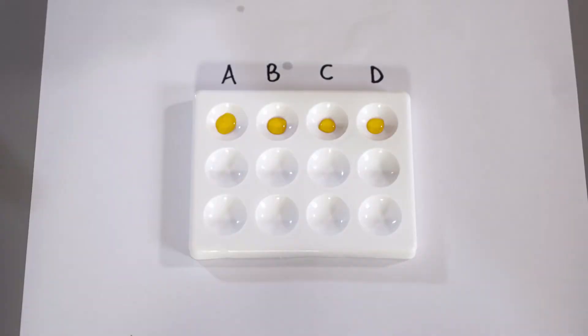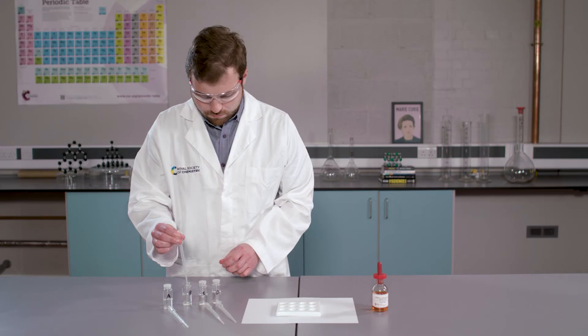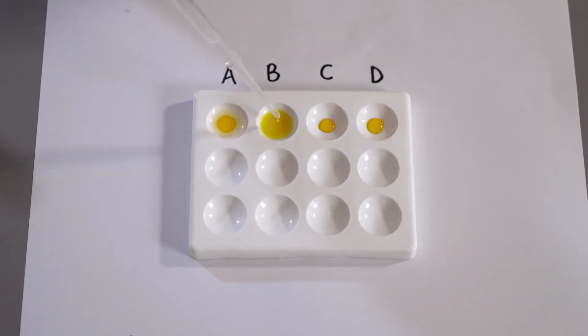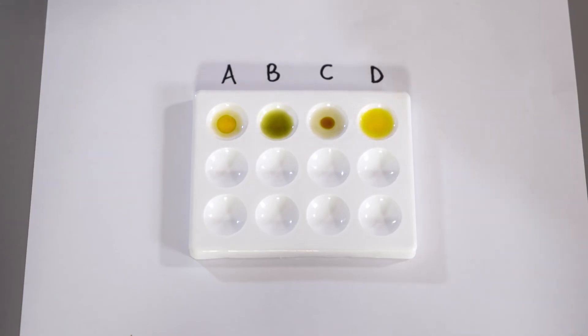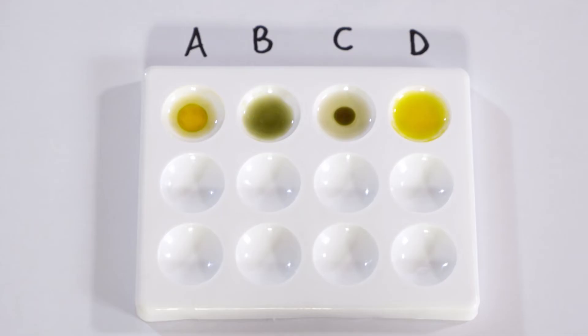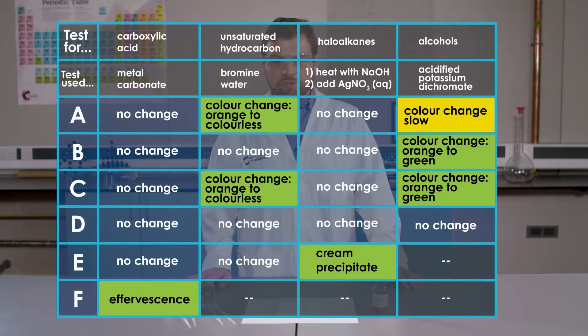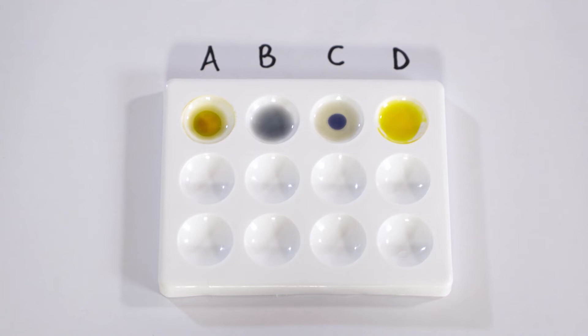Now I am going to add our samples A, B, C and D to each of the wells in turn. We can see sample B is already turning green. We can see sample C is also slowly turning from orange to green. Sample A turns to green, albeit very slowly. Alkenes can be oxidised by acidified potassium dichromate, however the reaction is very slow. This indicates that sample A is our alkene. We now see sample B is turning blue. This is because the chromium 3 ions are being further reduced to chromium 2 ions. Sample D remains unchanged. As you can see we have a positive result for samples B and C, a partial positive result for sample A and a negative result for sample D. This indicates that samples B and C are either primary alcohols, secondary alcohols or aldehydes.